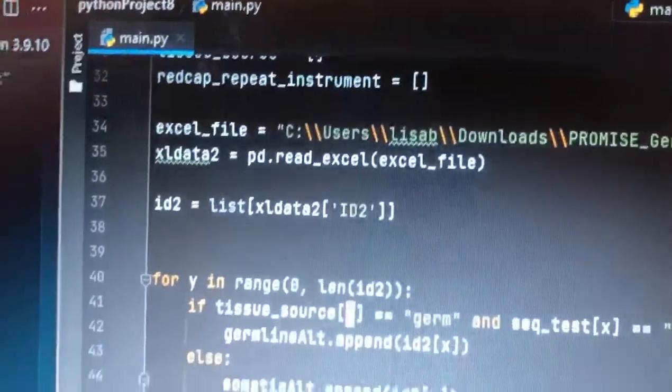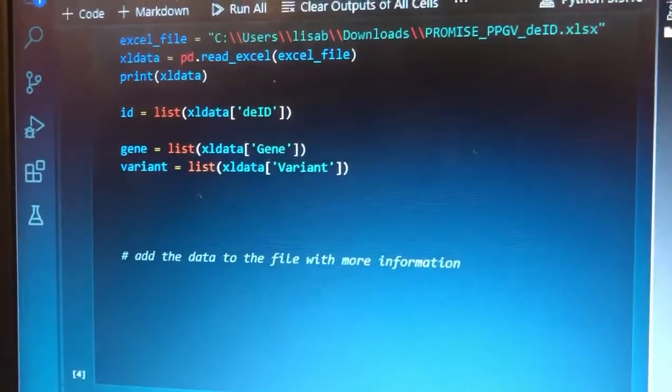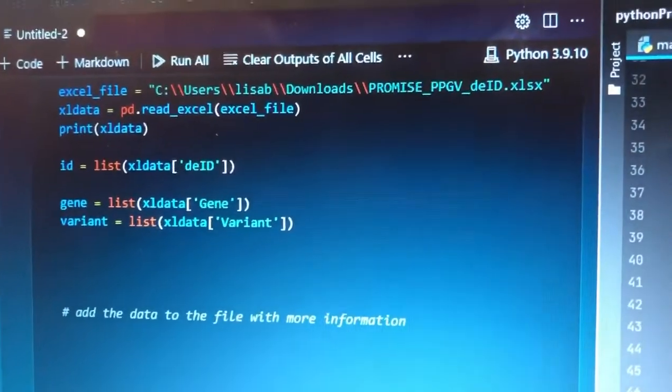I sought to develop computing algorithms that would analyze cancer DNA sequencing for specific patterns, and flag mutations that are likely to be germline. Now, here is my data. As we can see, I have a smaller data set, and I also have a much larger data set.